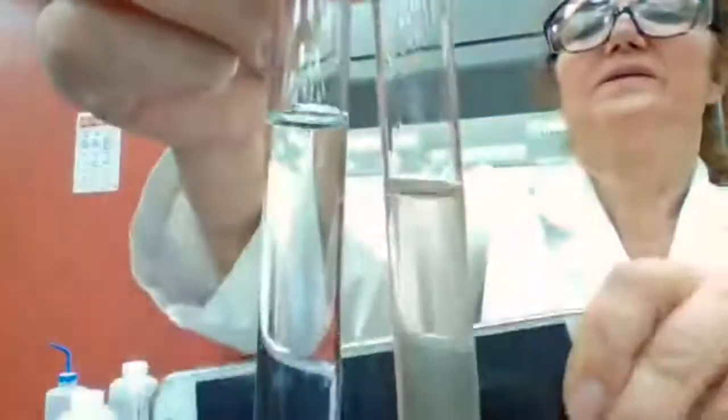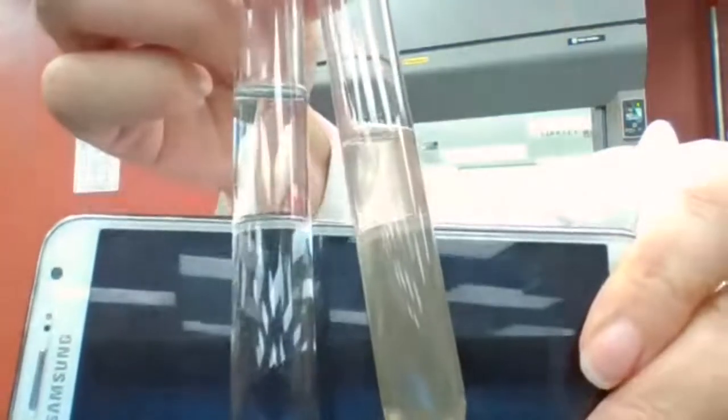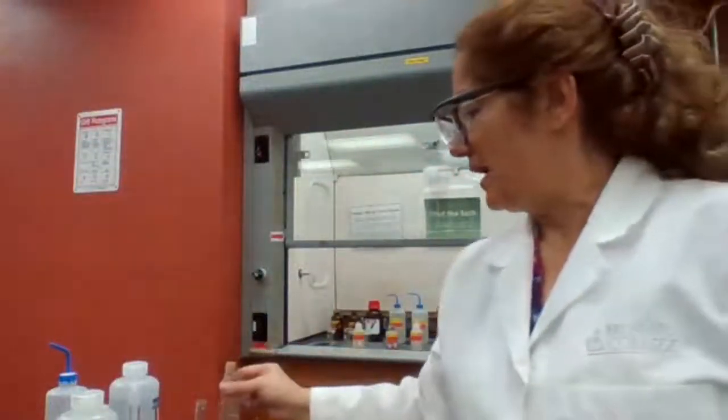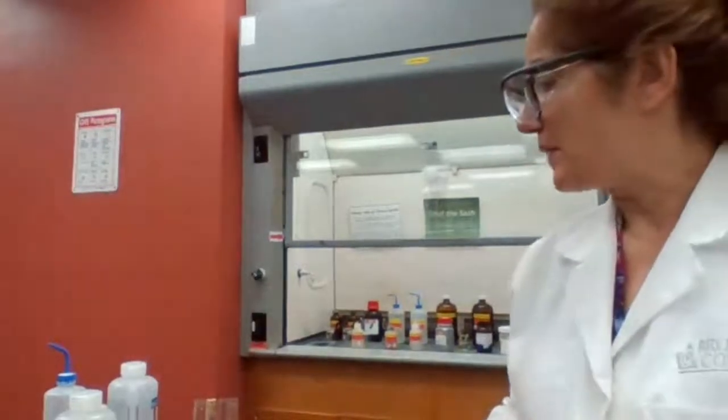So it is more cloudy than the water, but doesn't have solid pieces. This is after adding HNO3. You could record this observation because in the lab we cannot change what we see. We record the observation as a result of the experiment, whatever it is.